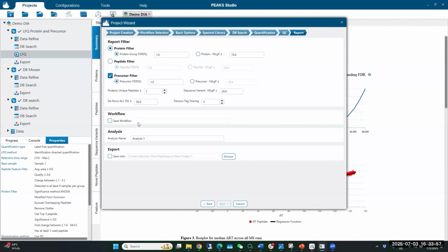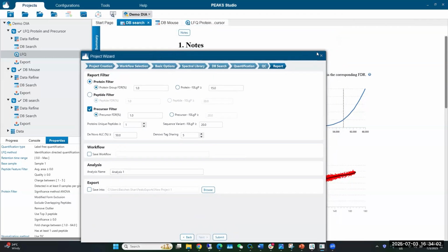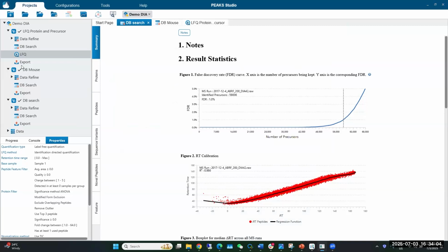Export those results for me. And this is a DIA selective. And in here, I show you one data set, which is from human.